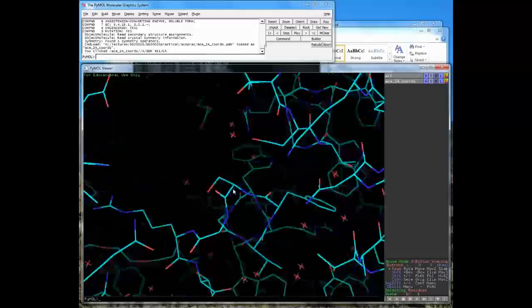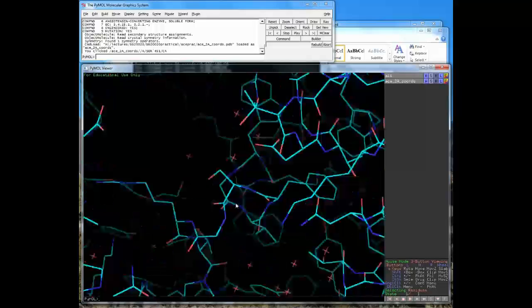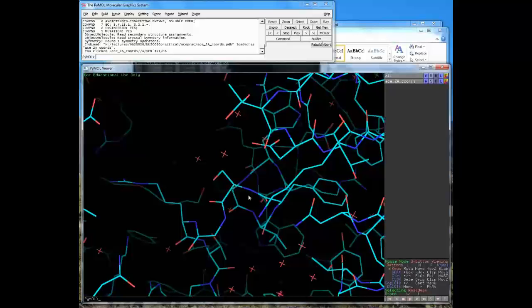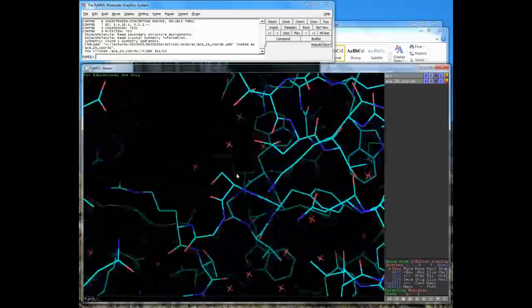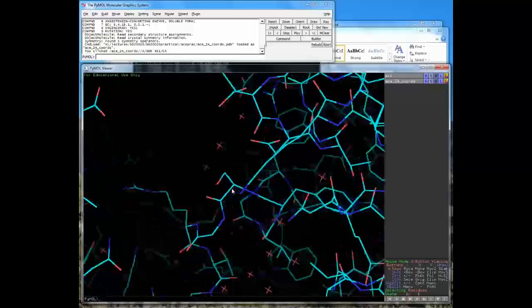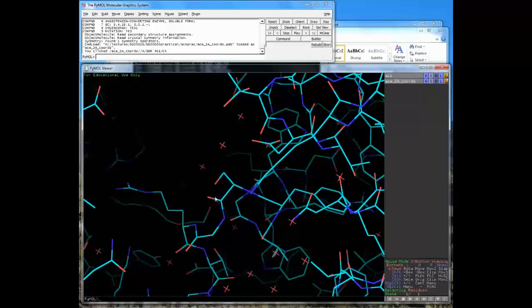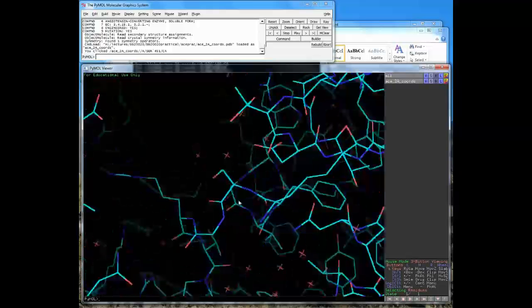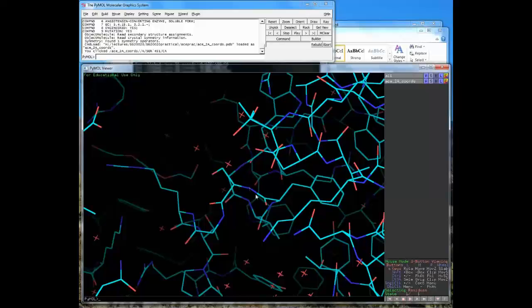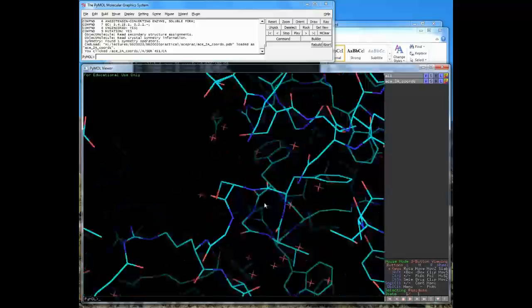And so here we can see represented, at each of the points where these lines meet represents an atom. So this is an alpha carbon atom in this residue here, which is a serine. You can see this is the serine side chain because it's got 1 carbon, and then the red indicates an oxygen. So this is a serine. This is the peptide bond here. Usually we have blue indicating nitrogen, and then this carbonyl oxygen here, also represented in red. And so we can trace through this long stick our backbone of our polypeptide chain, and off this we can see various side chains.